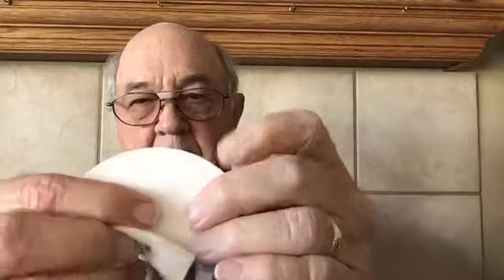So I have a small blood stain here, and what I'm going to do is rub it with this piece of filter paper. I'm not going to rub it completely off, just going to rub the blood stain with the paper, and hopefully enough hemoglobin will transfer to get a positive test. It's a very small stain and it's on a cotton cloth, so sometimes it doesn't transfer very well, but we'll see how it goes.